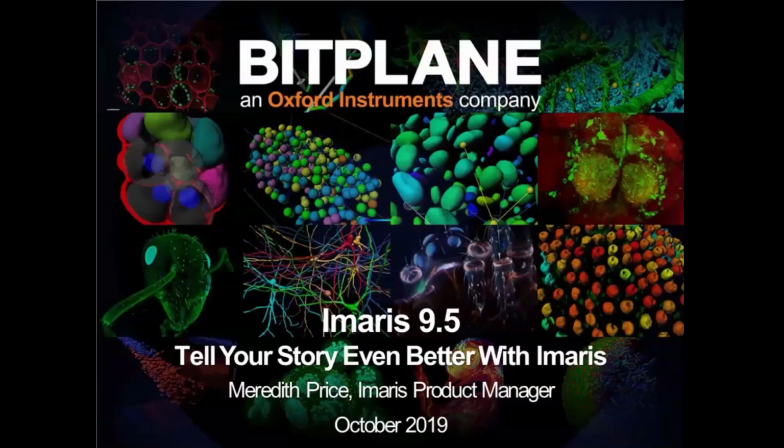We're not going to get rid of that extension because there are some extra things that you can do with it. It's definitely something that we're interested in for the future, not getting rid of it, but incorporating more of this type of work. You will still be able to create a distance channel and use it from there, but we found that just getting some of these measurements out was used so often, we wanted to make it easier for people.